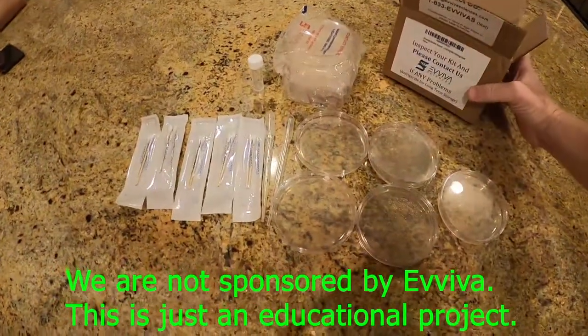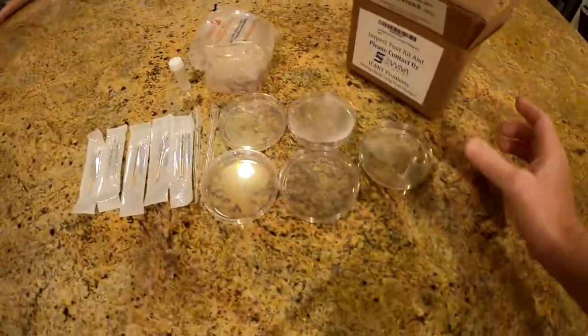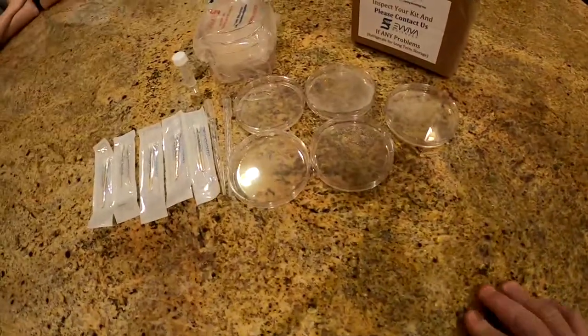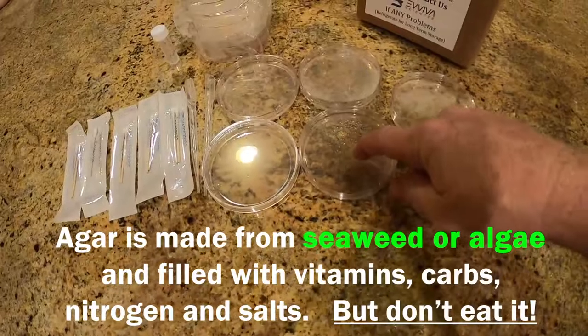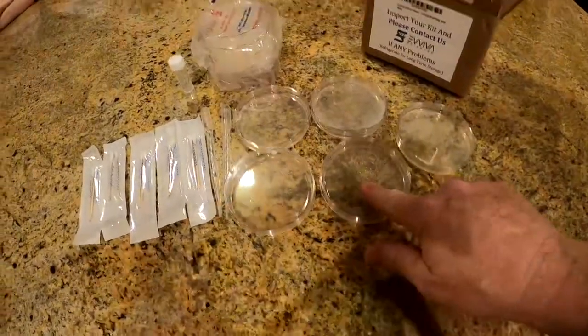When you order your kit from Amazon, you get a box that has 10 petri dishes with agar already mixed in them. Agar is a gelatin-like substance that's used to grow bacteria.